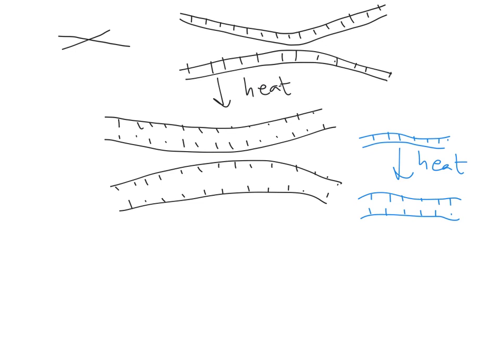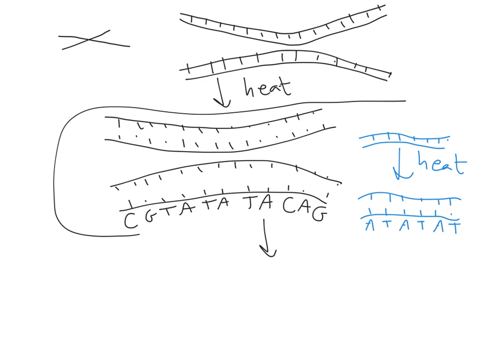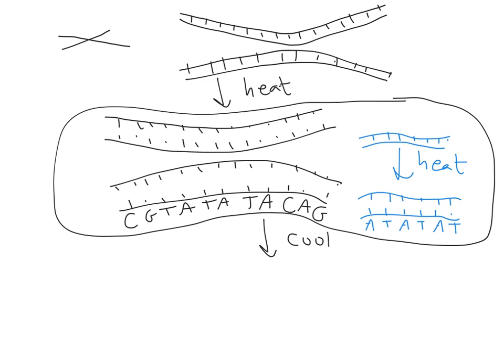Now if I add some letters here, let's use a dinucleotide repeat. Say that this molecule has the sequence AT, AT, AT. And let's make up a short sequence of nucleotides for the chromosome that we're looking at. Now the next step is, while all of these molecules are together, you mix the probe with the chromosomes, and you slowly cool the mixture back down.